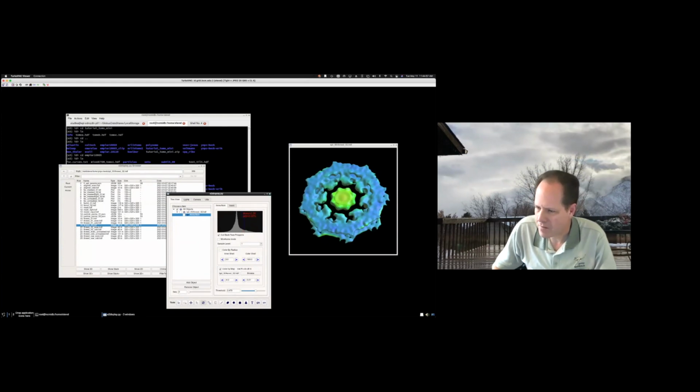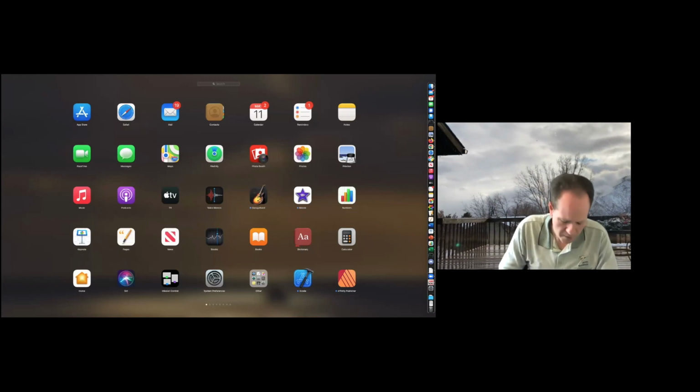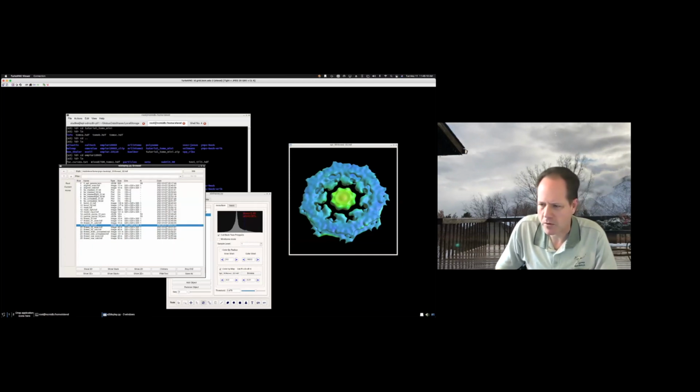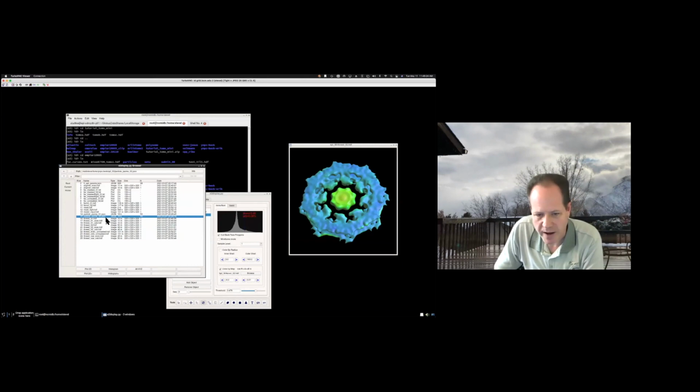Now, looking at a subtomogram of an individual particle is generally pretty noisy. It's often hard to see anything. So very often you'd like to look at these things in terms of projections. So there's a new tool that's available in the graphical interface here, which you can use with one of these particle params JSON files.